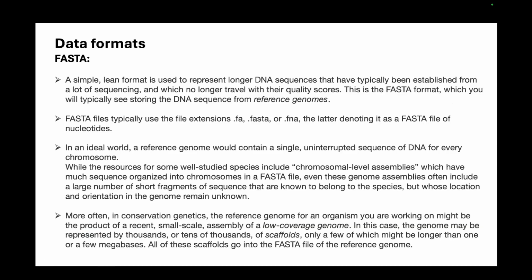Now that we have understood in general what quality scores are, and how different base callers identify the different nucleotides at particular regions, what we'll see is how we put them in different data formats. The simplest of these data formats is the FASTA format.